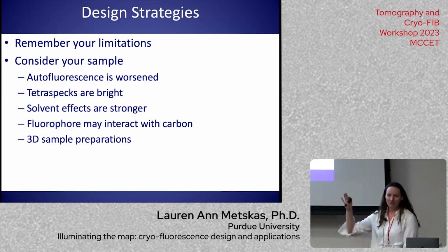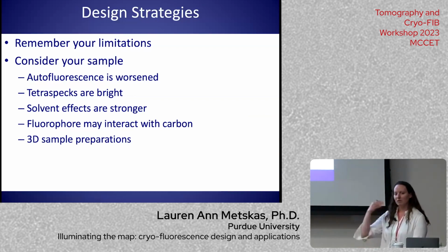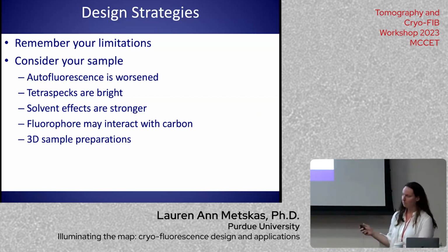And then, of course, I'm not even getting into the 3D sample preparations. But you can imagine if you've got a large area of your cell that has a lot of depth, you're going to have fluorophores stacked. They might all have different chemical compositions in those respective layers. It can get to be a real mess. So just think through your experiment, know what the most likely failure points are going to be, and either design around it or run some controls and make sure that you really know what you're looking at.